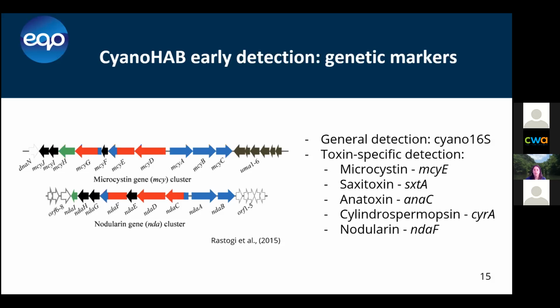What we can do is take advantage of the fact that non-toxic cyanobacteria won't have these MCY genes, even though that's not totally true. Some of them are lacking, some of them have partial copies of some, it just varies by species. But we can create a probe using something like the MCYE gene, so we can detect if that gene is being actively transcribed or not in the environment.